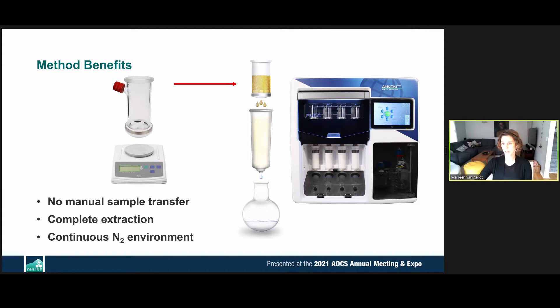The instrument digests according to a programmed method. The base method runs at 75°C for 45 minutes in a nitrogen environment, followed by pressure release and continual mixing. After that stage, the saponification solution filters through the bottom port of the digestion vessel onto the SPE column.